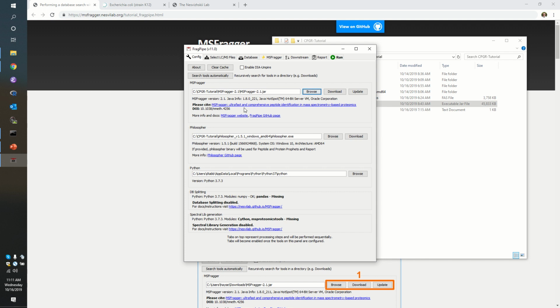This should be common sense, but just the same, it's worth saying. I would also note that the software FragPipe is a really useful interface for deciding whether or not you are up to date. Because when you tell it to go to MSFragger 2.1, it's going out to the network and sniffing to see if there's a more recent version of the software there. So even if you haven't been watching the Twitter feed, your user interface here might say, hey, you really need to think about updating your code.